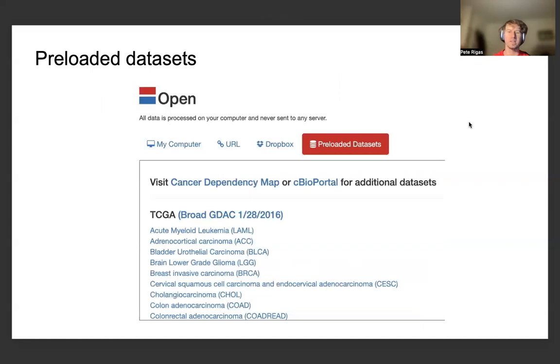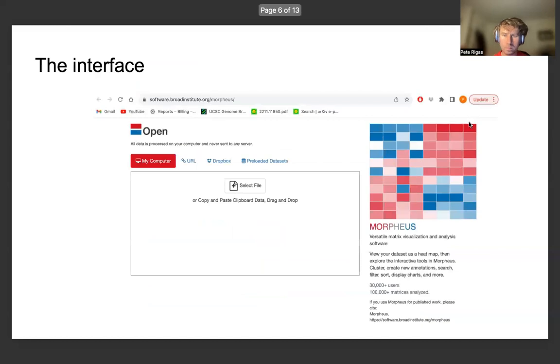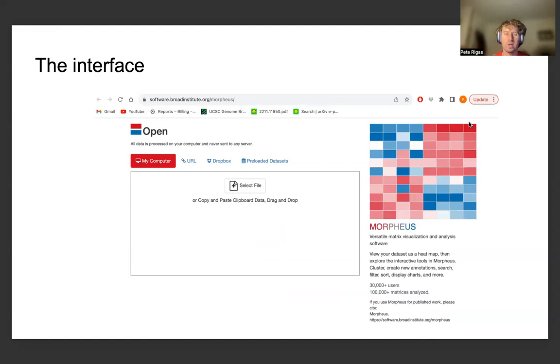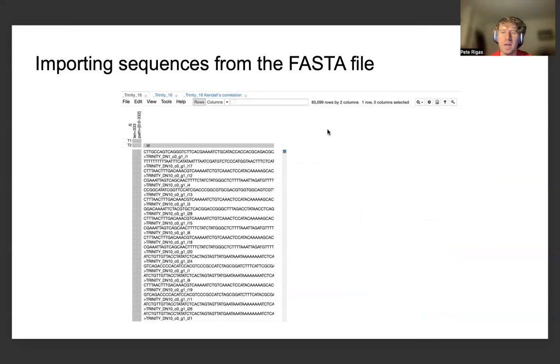This is an example of some of the preloaded datasets which one can use, which are going to be a little bit different than the FASTA file that I'm going to be loading into Morpheus. This gives an idea of the interface, in which one can directly drag and load the FASTA file or whatever collection of genetic sequences one is interested in looking at.